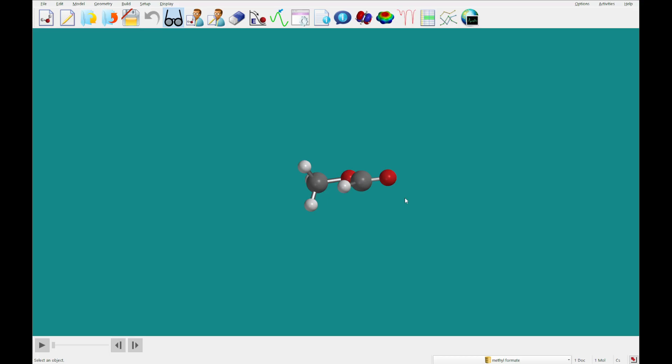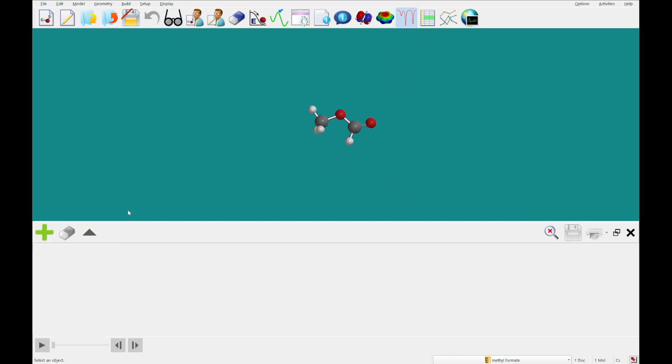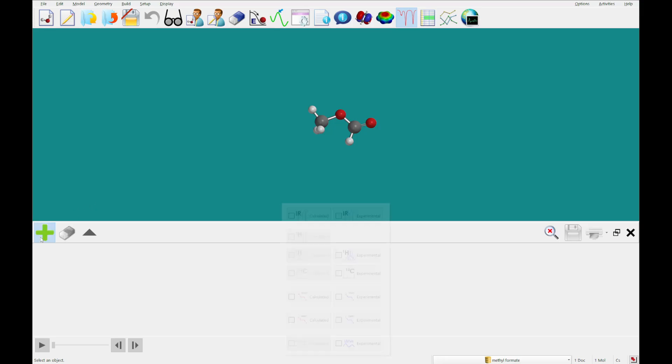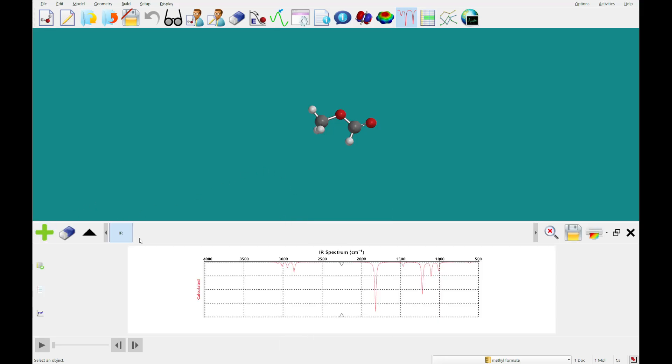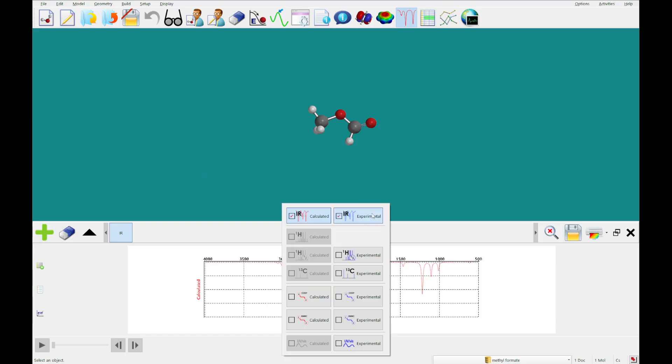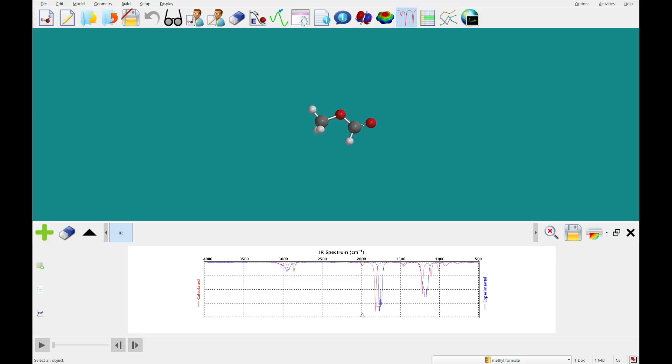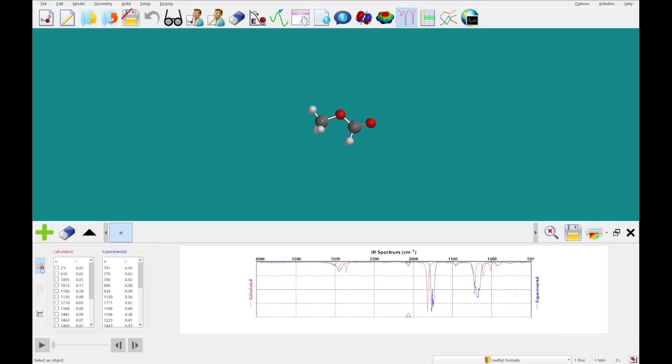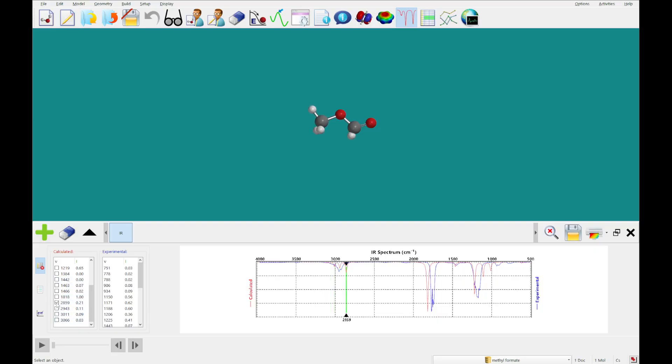Alright, so that one's just completed. What we're going to do now is click the Spectra panel, and I'm going to add the calculated infrared, as well as the experimental. And I'm going to either scroll over these different peaks, like this, or add the table, and then you can click through them with the checkboxes.